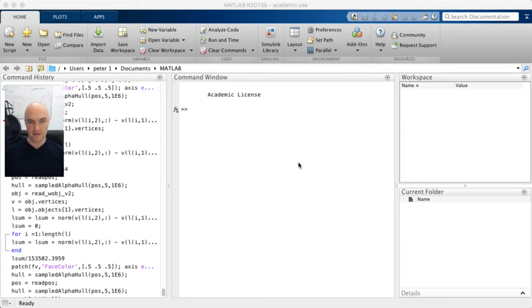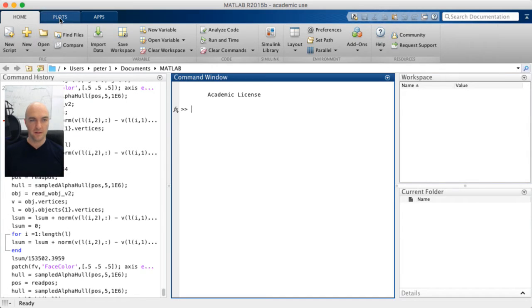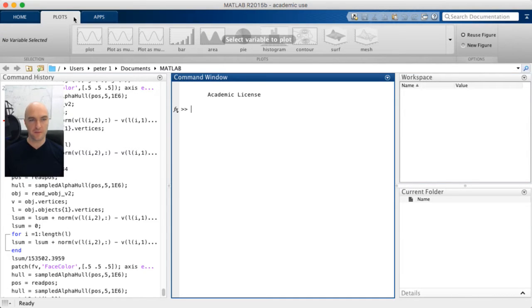The first thing is, of course, how to get started with Matlab and how to get your atom probe data loaded in. So, a quick tour through Matlab and the way I've set it up today. You've got your ribbon here that gives you all sorts of options, like creating new scripts or new variables. But we will mostly work through the command line. We'll occasionally use this for making plots, but again, that is usually better done through the command line.